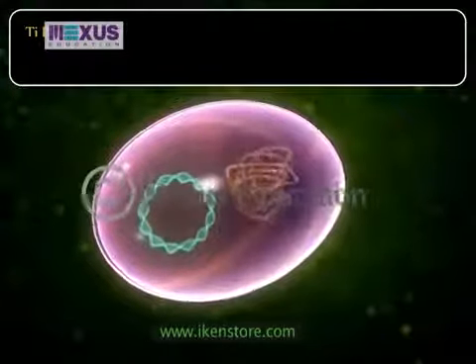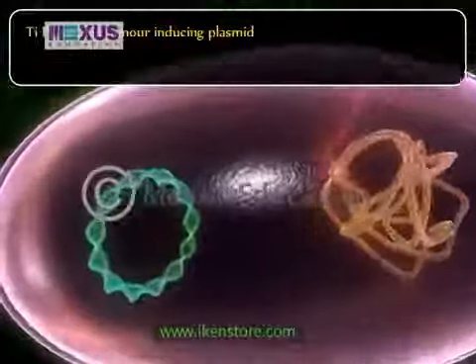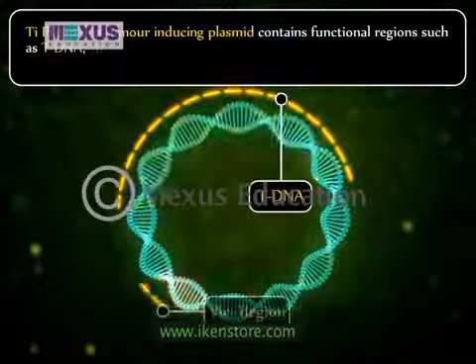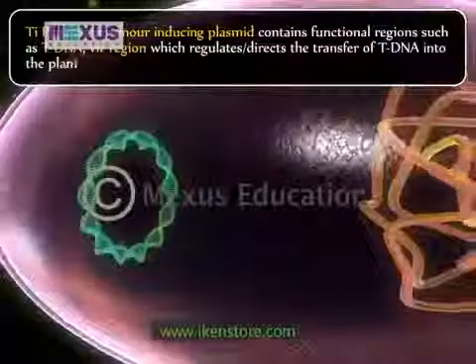Ti plasmid, that is, the tumor-inducing plasmid, is used in this technique. Ti plasmid contains functional regions such as tDNA, Vir region, which regulates or directs the transfer of tDNA into the plant cell.